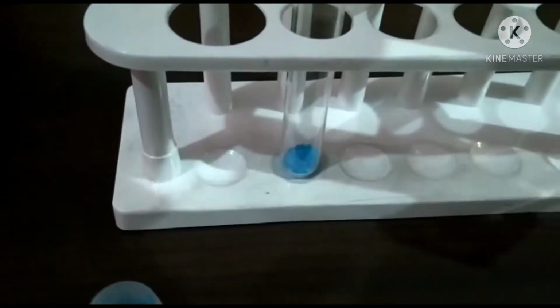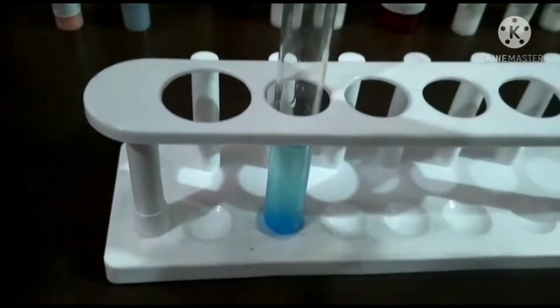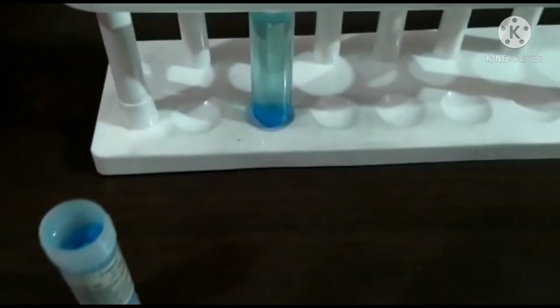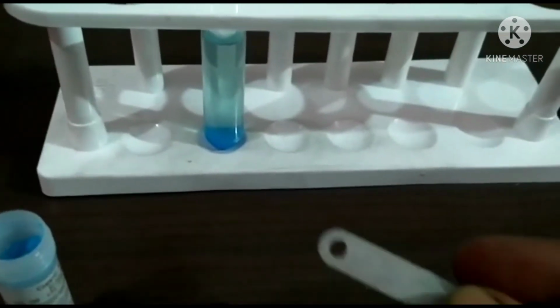When we take the solution of copper sulfate in water, this is the blue color copper sulfate solution, and we add iron to it.